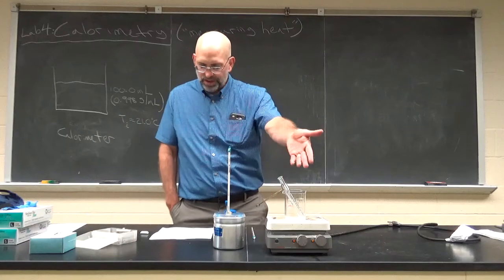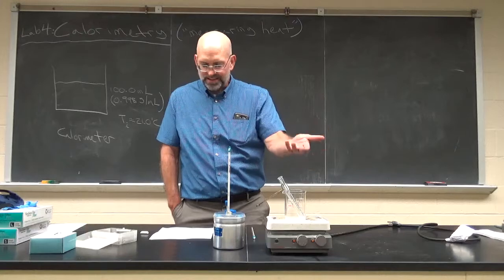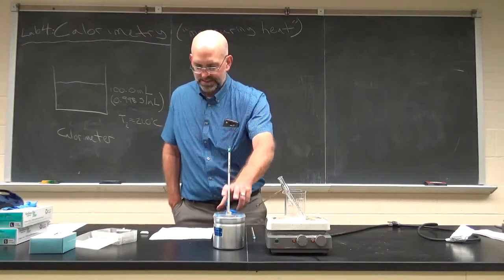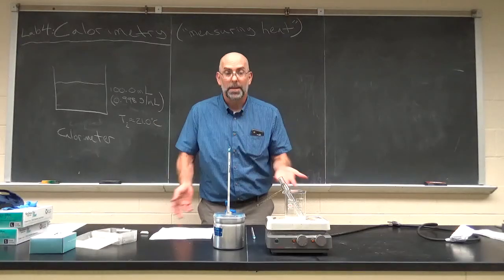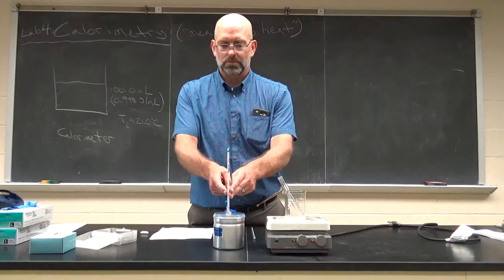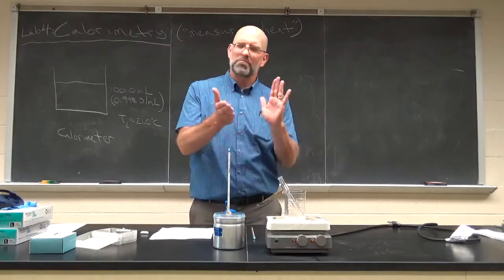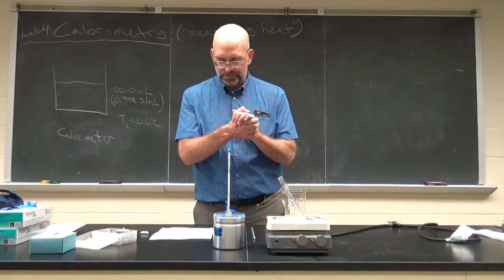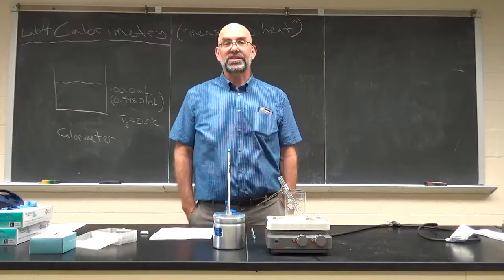Continue to boil the water. You don't need to record that every time. Once it's boiling, it should be the same temperature. And you do this twice again with 85 mils and 75 mils. That's the procedure. Pretty straightforward. The thing is, once you get this high temperature, get the aluminum piece back in here, get it back up for 15 more minutes. We may not have enough time for 3 trials if we do 15 minutes. We will see.